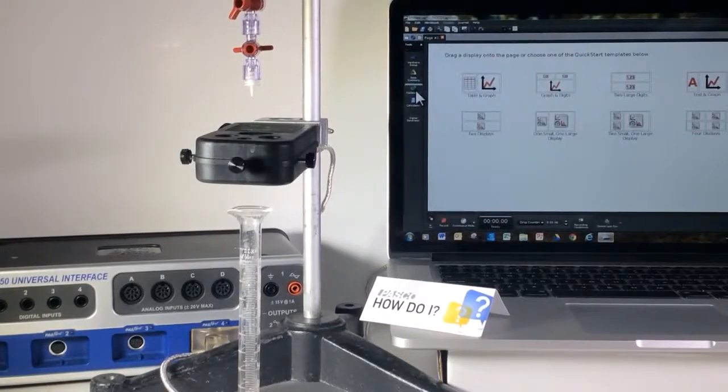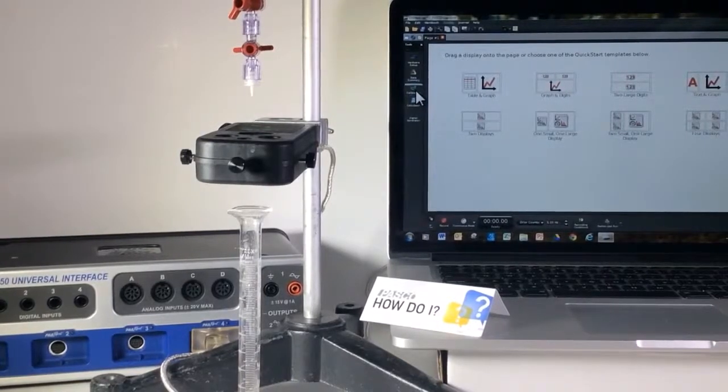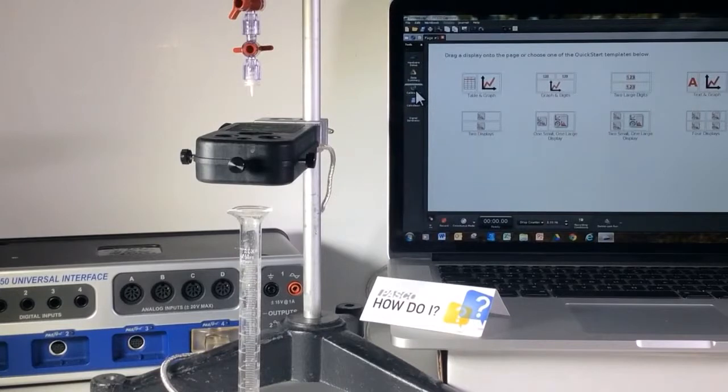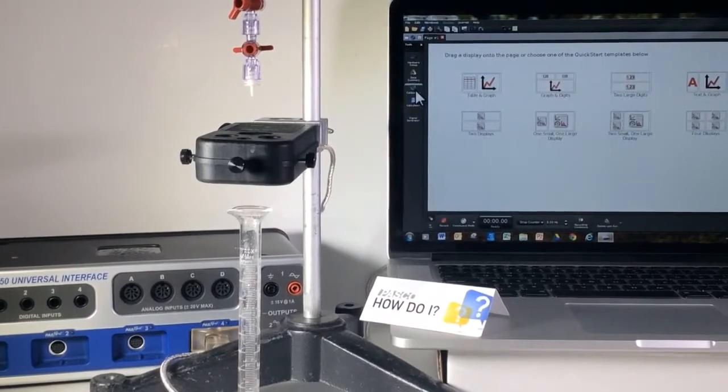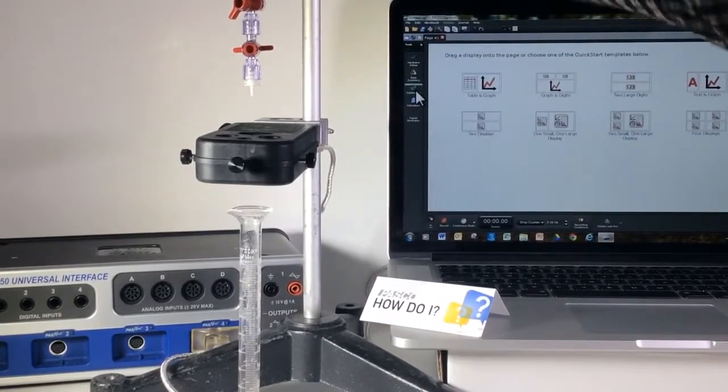How do I calibrate a drop counter using PASCO's capstone program? To do this, I've already set up a syringe with the titrant in it.